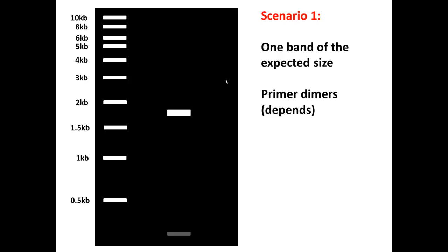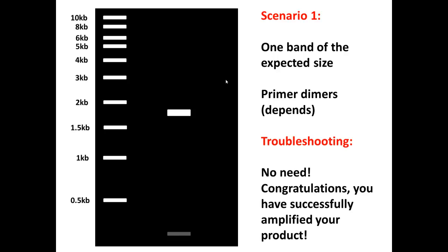Let's say you run your PCR reaction and then you run 5 microliters of that on a DNA gel and you want to see what it looks like. So this is scenario one: you get one band of the expected size and you get some primer dimers which is very common. What's the troubleshooting step? Well, actually you don't need to troubleshoot if this is what you're seeing. You successfully amplified your fragment of interest and congratulations. You can now turn off this video and go ahead and do your next part of the experiment. This is obviously the ideal situation.